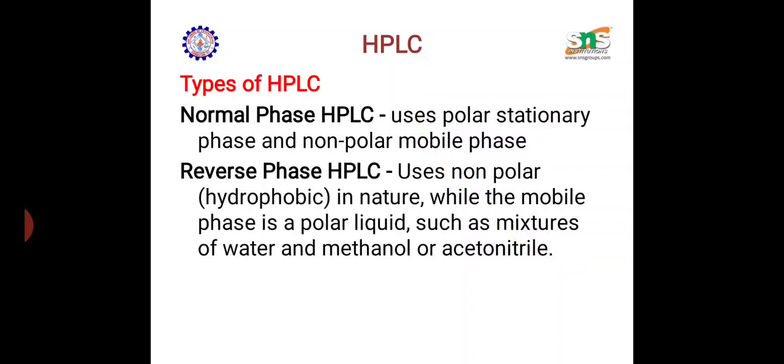So there are several types, not only two. Normal phase HPLC uses a polar stationary phase and a non-polar mobile phase. In reverse phase, the stationary phase is non-polar in nature, and the mobile phase will be polar, and a mixture of water and methanol can be used.